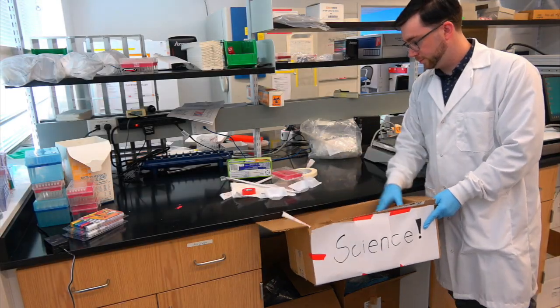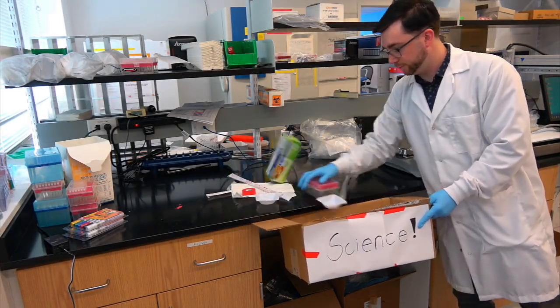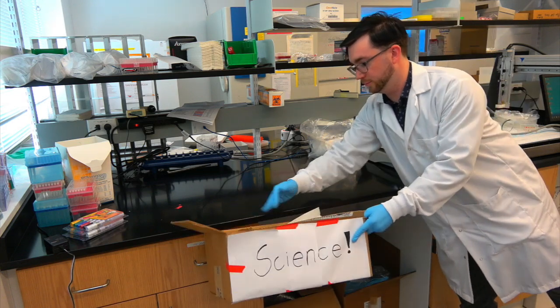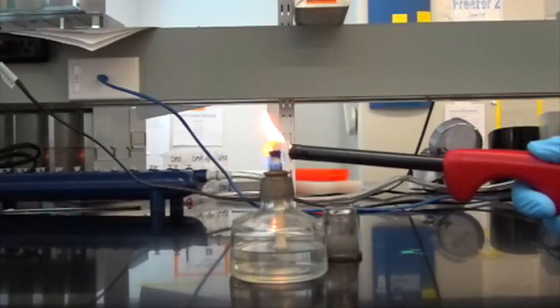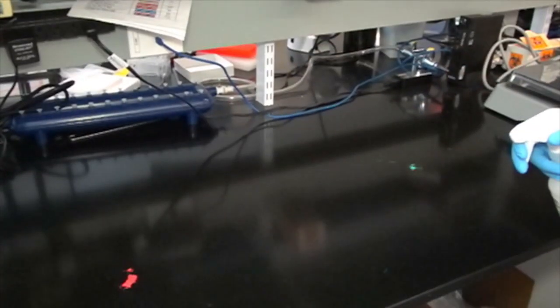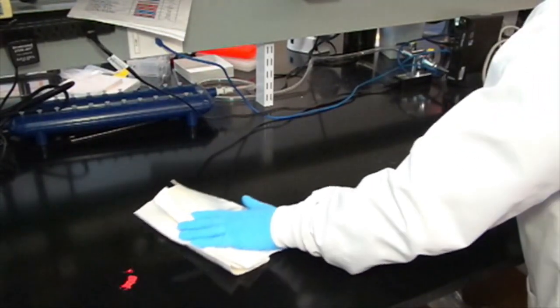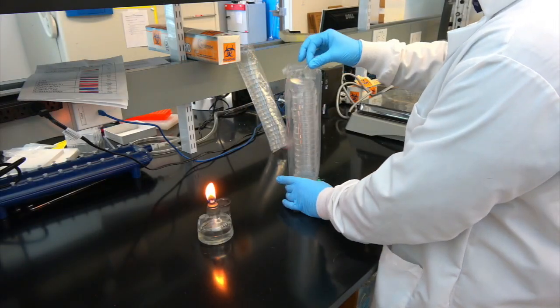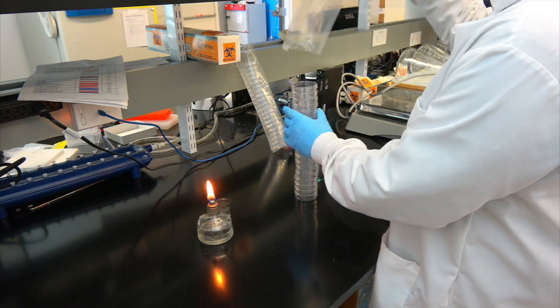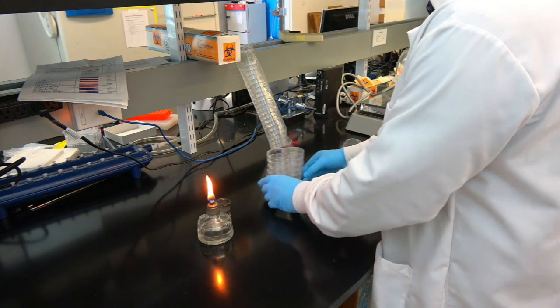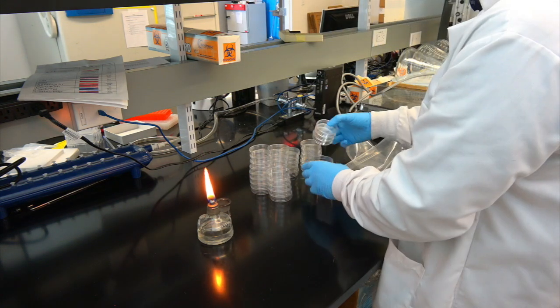While the LB agar is sterilizing in the autoclave, we will prepare our bench for plate pouring. First, we find or make an empty section of bench with a working flame. Then we spray down the bench with 70% ethanol and wipe it with a paper towel. Once the bench is clean, we count out the appropriate number of plates and leave them stacked in an easily accessible location. Be careful not to stack them too high, lest we have an architectural disaster.